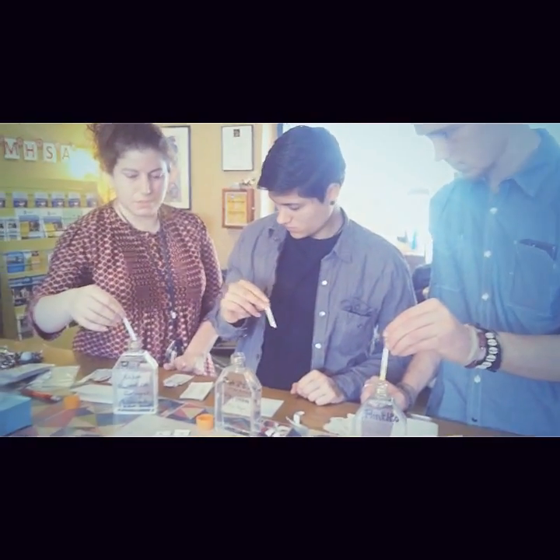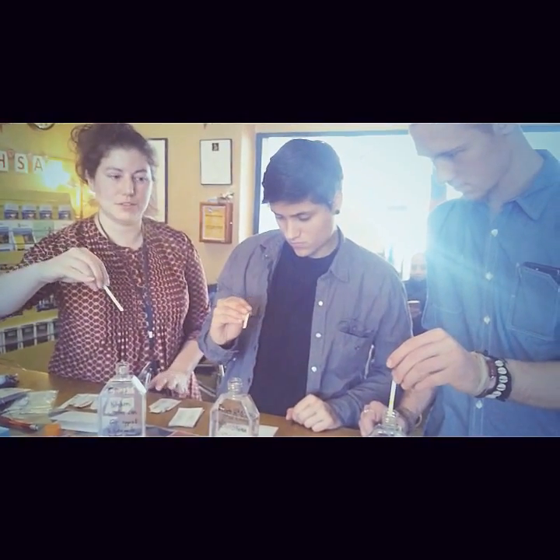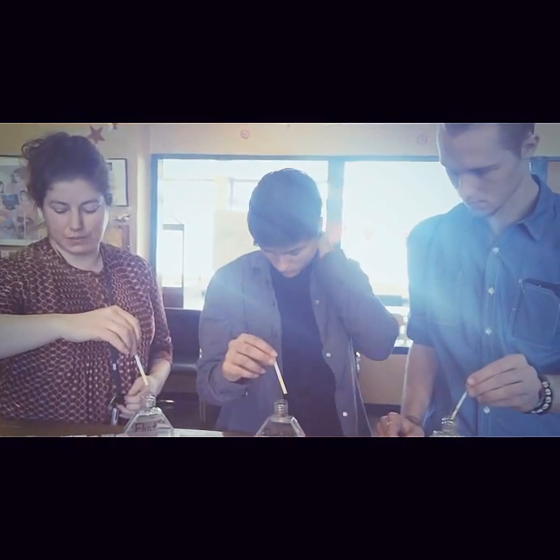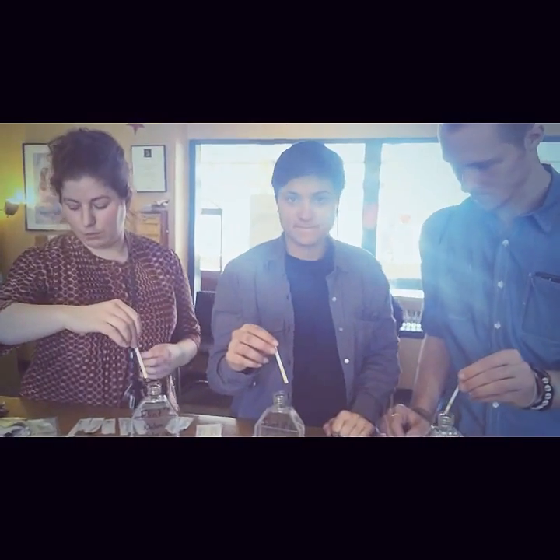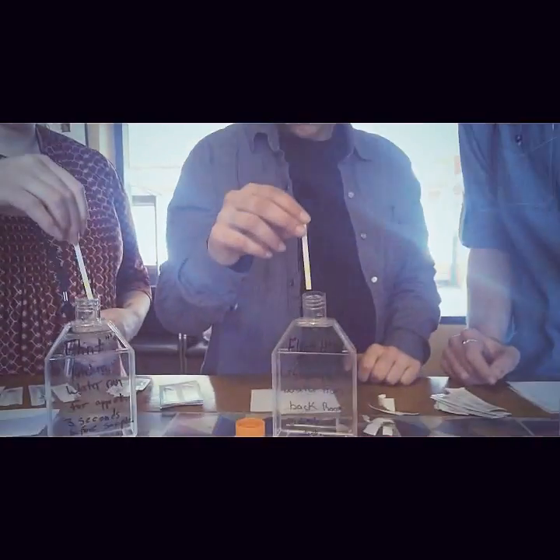So this one, we're all done. You guys should be able to see color change happen as a result of different pHs and alkalinity. The higher the rating for alkalinity, the more contaminants there typically are in the water. So let's see what we get. The greener it gets, the more contaminants are normally there. Wow, all right. You ready?